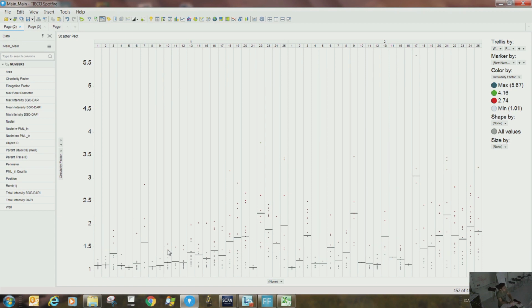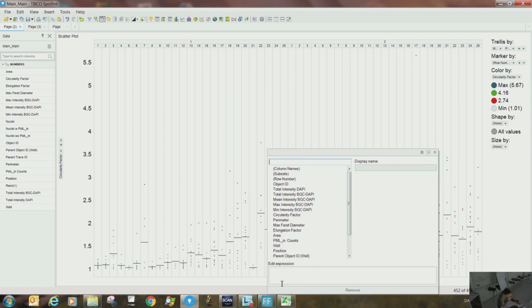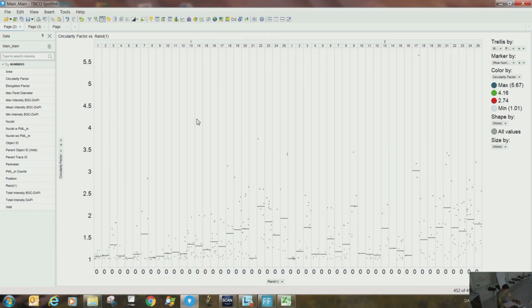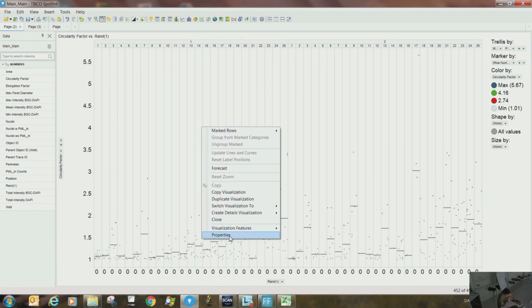So to get rid of this overlap, we are just creating fake x-axis information, a dimension, just to visualize things. Yeah, exactly. That's just to aid in the visualization. Okay. That's it. So this is all about, again, the same thing.